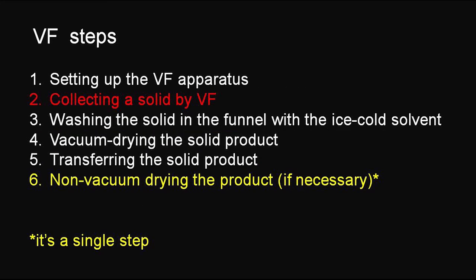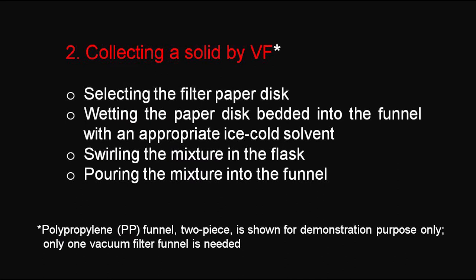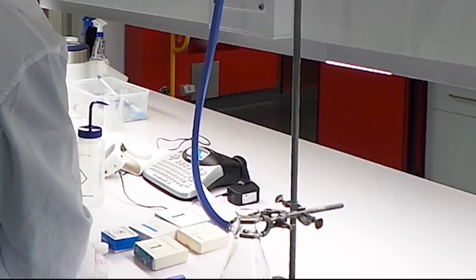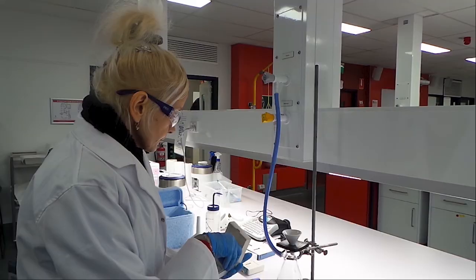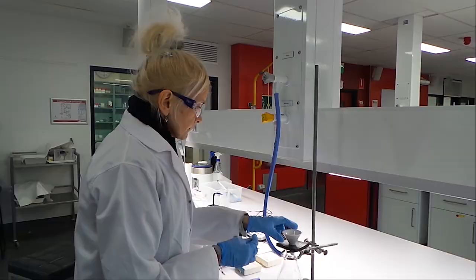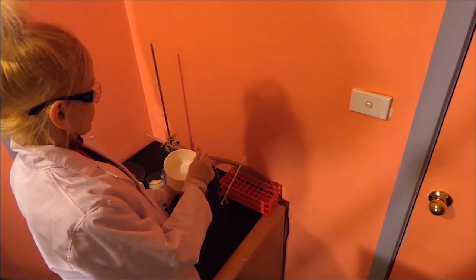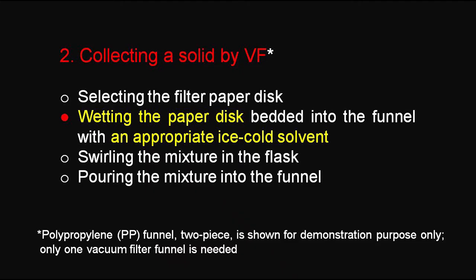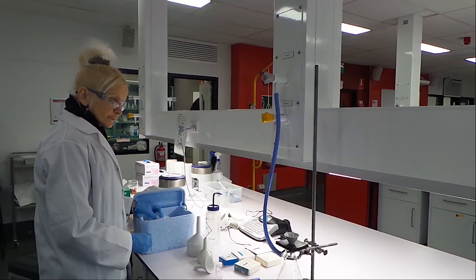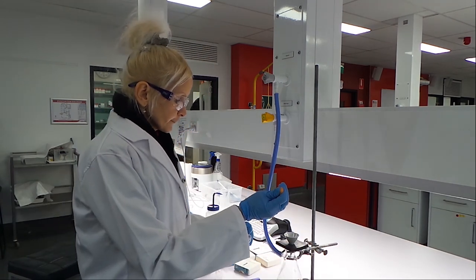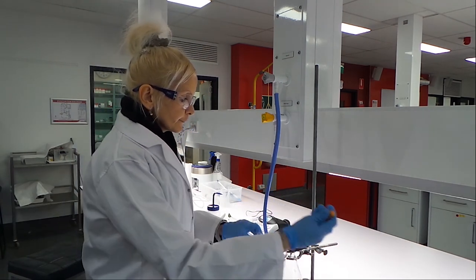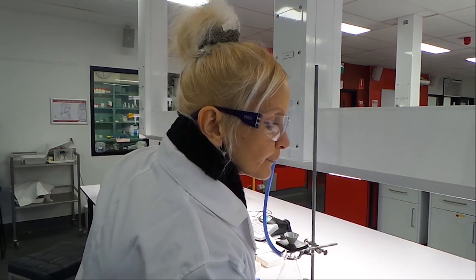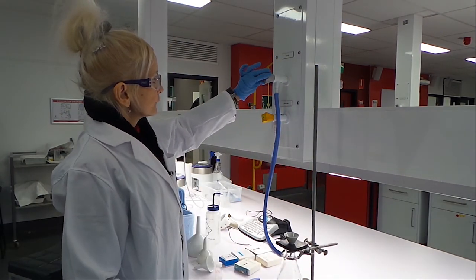Now we are ready to start collecting a solid by vacuum filtration. We need to select a suitable filter paper disk — there are many kinds with different characteristics, so make sure you select the right one for your application. A filter paper disk should be small enough to remain flat but large enough to cover all the holes in the bottom of the funnel, and the edge of the disk should not extend up the sides. It is essential to wet the filter paper disk placed in the funnel with a small amount of an appropriate ice-cold solvent to create a seal between the paper disk and the funnel. Then apply a gentle vacuum and check to make sure that air is being drawn through the paper disk.